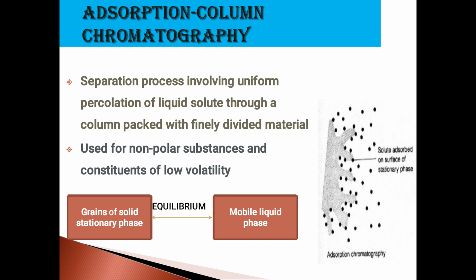In this technique, the separation process involves uniform percolation of a liquid solute through a column packed with finely divided material. It is used for non-polar substances and constituents of low volatility.